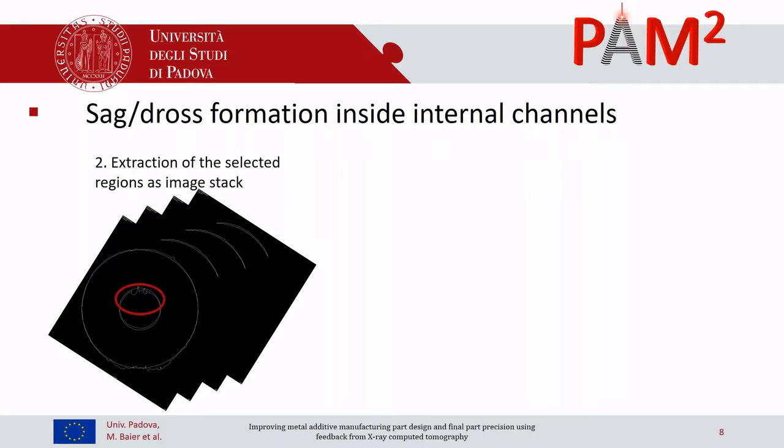How does the accuracy of the overlapping really affect the true porosity, for example? What do you mean by accuracy of overlapping? You scan this portion and then when you scan another portion, there is some overlapping. Yeah, exactly. I mean, does the overlapping error really affect the true porosity over there, so that error is introduced because of this overlapping stitching process? Of course, if you apply stitching, you introduce some errors.